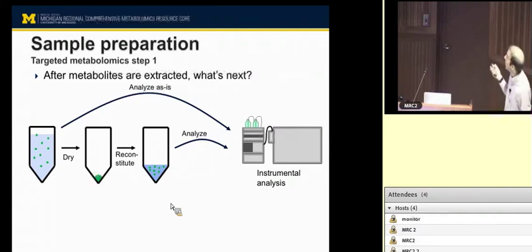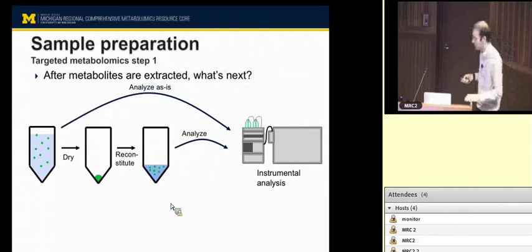Generally, untargeted metabolomics is limited to relative quantitation, things like fold change or some other quantitative metric, which will give you an idea of how things differ between groups, but it won't necessarily be absolute quantitation, a micromolar concentration. And so if you were looking for a global study of metabolic response to a change in diet, that might be a good example of an untargeted study.